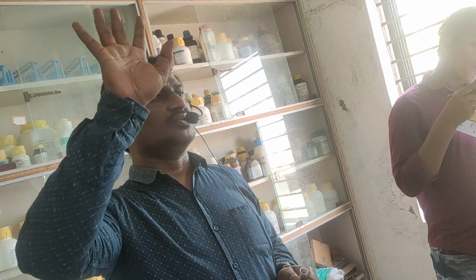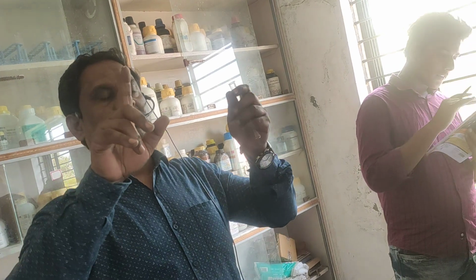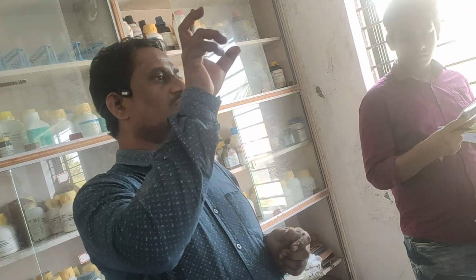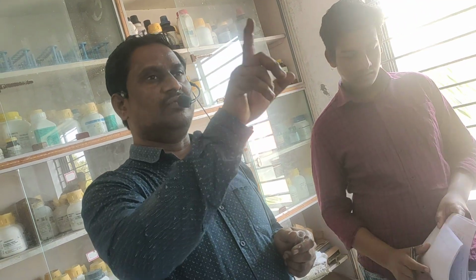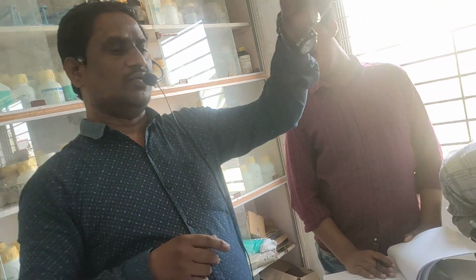Look here, all of you. We have 6 groups, and in these 6 groups only one group will be present. For this group table there is 1 mark. So for cation detection, first you have to identify this group table. Now I am doing the group table.